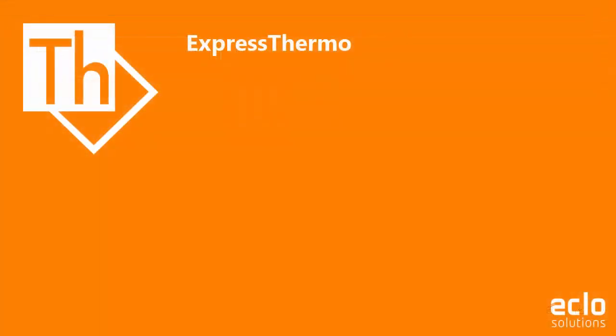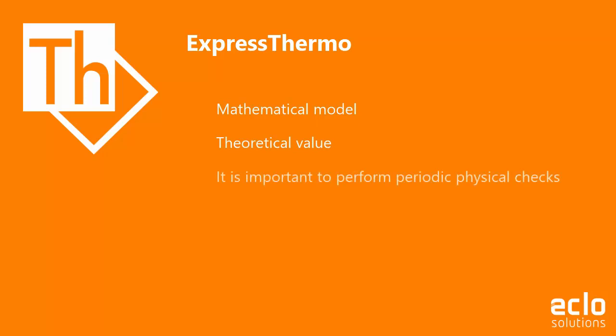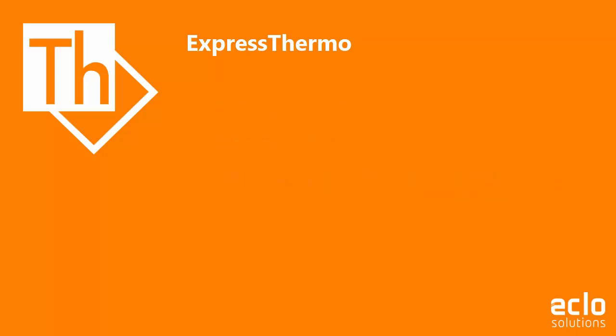Please note that the calculation of pasteurization or sterilization units is a mathematical model and provides a theoretical value. It is important to periodically verify the process through bacteriological analyses of processed products. This concludes the tutorial on the optional heat treatment validation module.